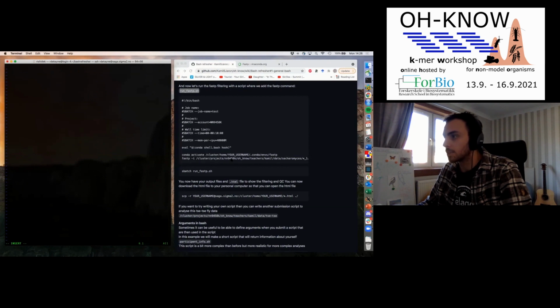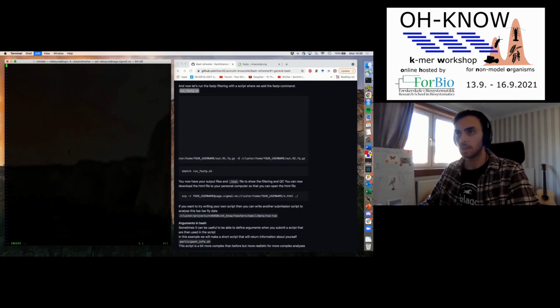The little i here gives it the forward reads, and the big I gives it the reverse reads. And then we will just give it an output directory. So again, you'll have to fill in your username. This is telling it that I want it to write the output to this directory.